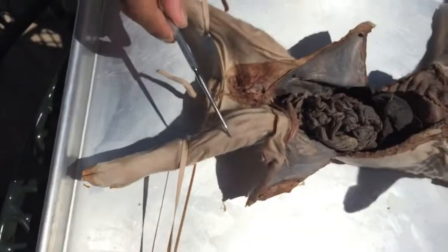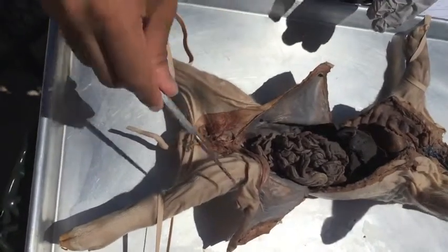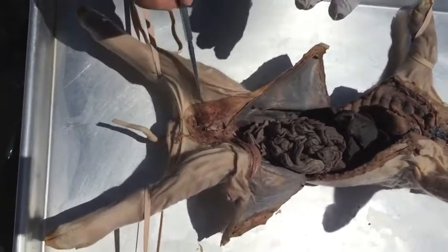So you can't see them because we didn't really open up the feet, but they're down there. And then the same thing as the veins. The veins supply blood to the pelvic region over here. And again, didn't open it, so you can't really see it.